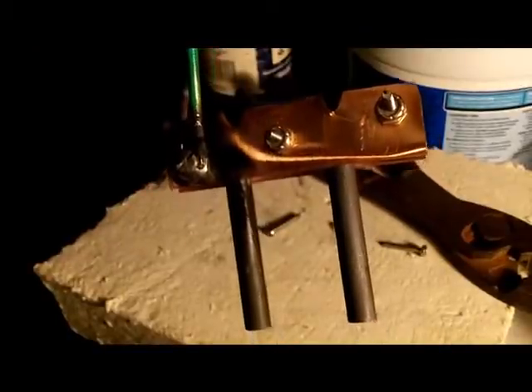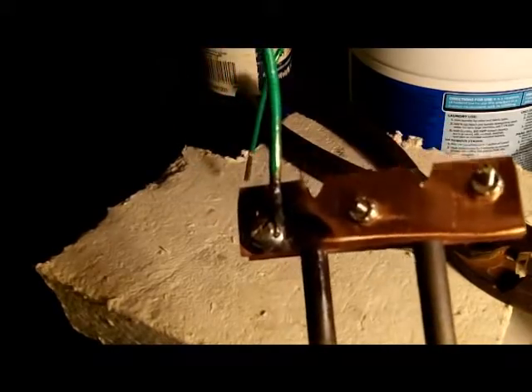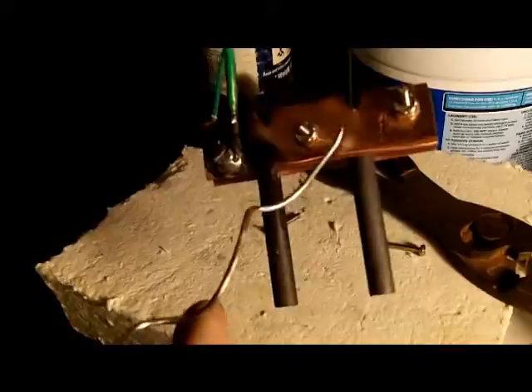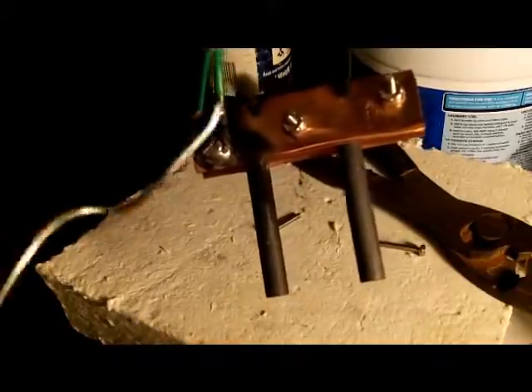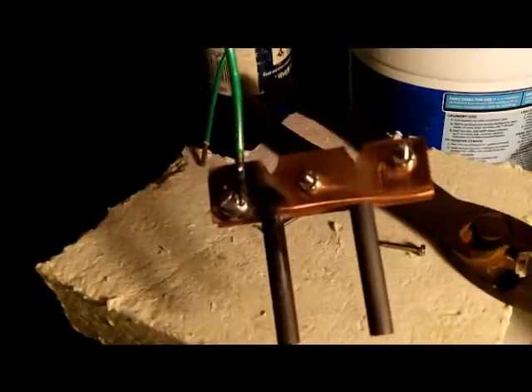Now the only thing left to do is let this cool and attach our coffee filter. Don't run the coffee filter all the way up around this stuff — you don't want it to wick acid up onto the copper. We want to keep all this metal on the anode side out of the solution. Pull it down, coffee filter, like so.